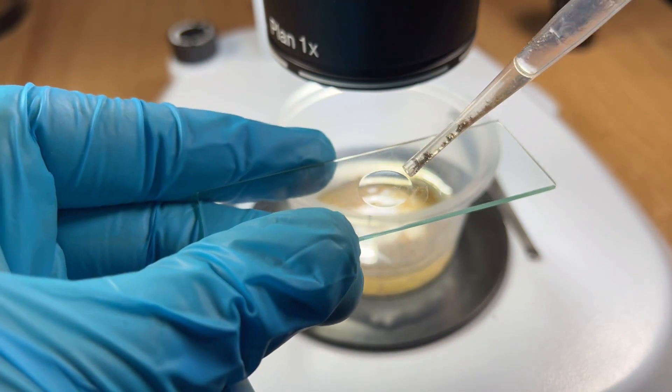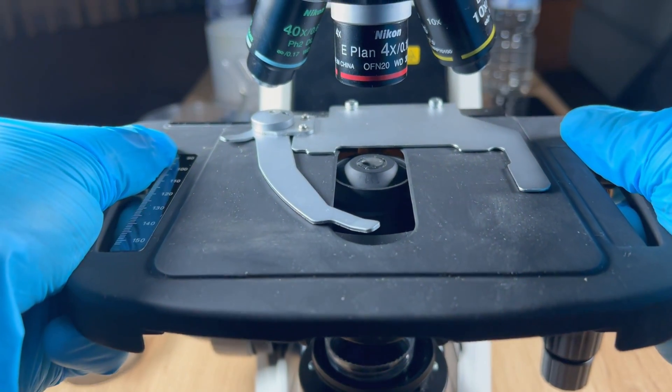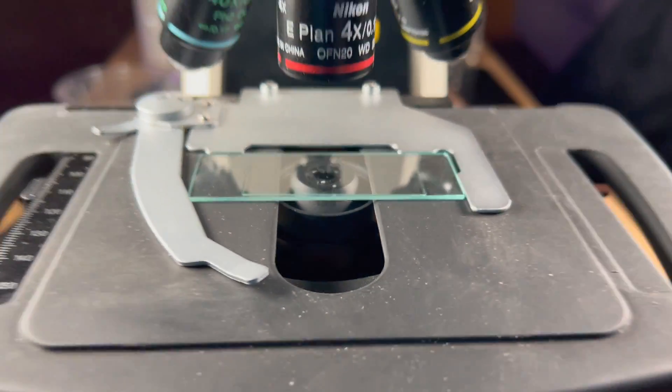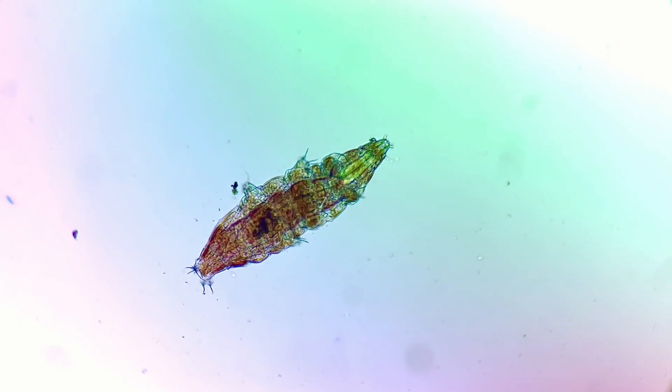Using my pipette, I take the water bear and put it onto a glass slide. This process helps filter out a lot of the dirt and debris that I collected from the rainwater, and it makes for much better viewing when we look at it under the biological microscope.